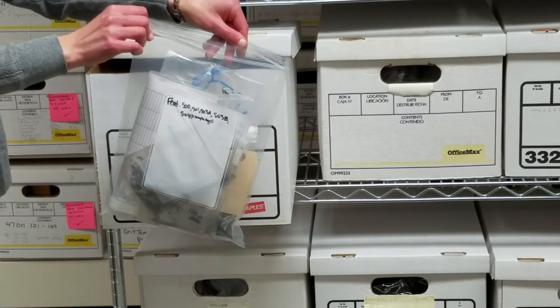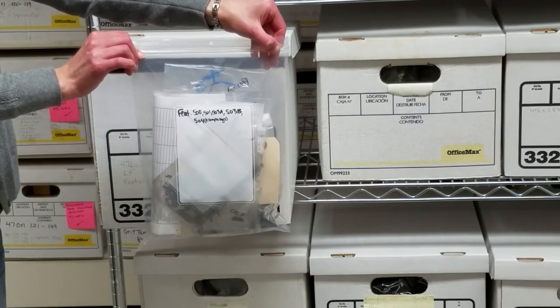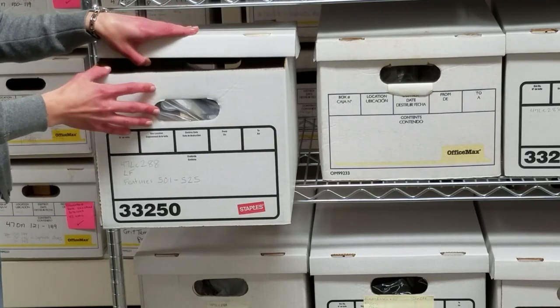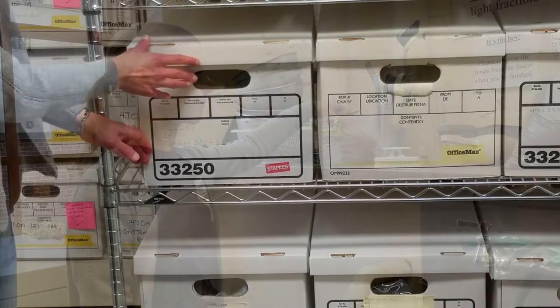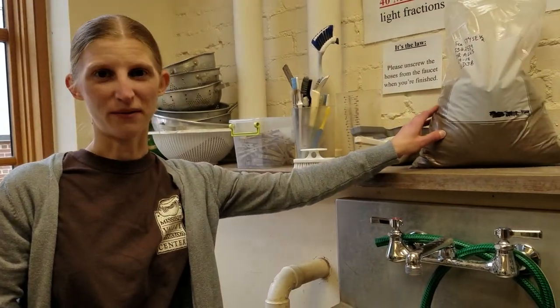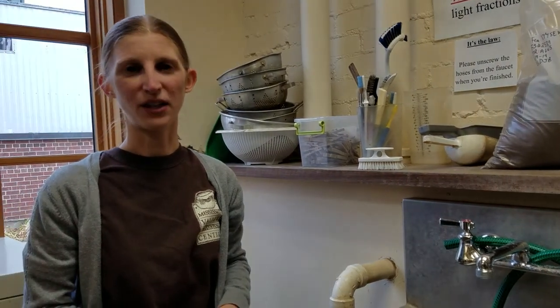Finally, we bag up the light and heavy fractions and also the things that we sorted from them. A label placed on every bag holds detailed information on the contents and where they came from. The samples are filed and stored so we can look at them again as needed or perform new analyses in the future. There you have it — the basics of flotation without even getting wet. And that is how, with the right process and fairly simple but effective equipment, a seemingly nondescript bag of dirt can reveal a wealth of information and become an integral part of archaeological research.